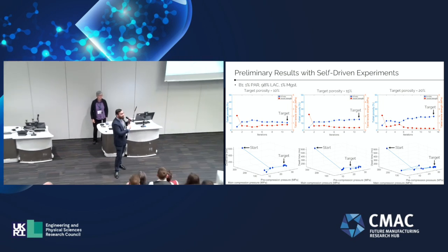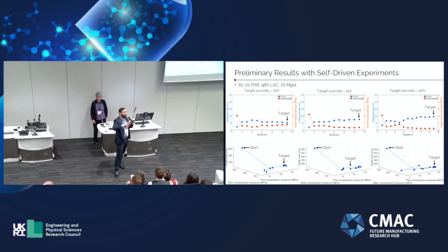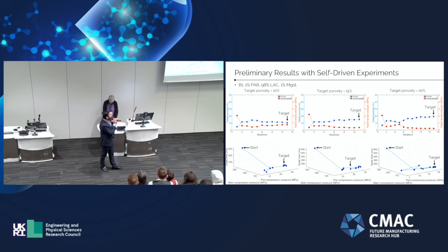So the first suggestion comes from that side. We run the experiment, and that's where the system runs the further experiments from that point onwards. But I'm not too sure, if we force that starting point to be a little bit different from the one suggested by the Bayesian optimizer, what's going to happen. Ideally it should reach that same point, I'm assuming.